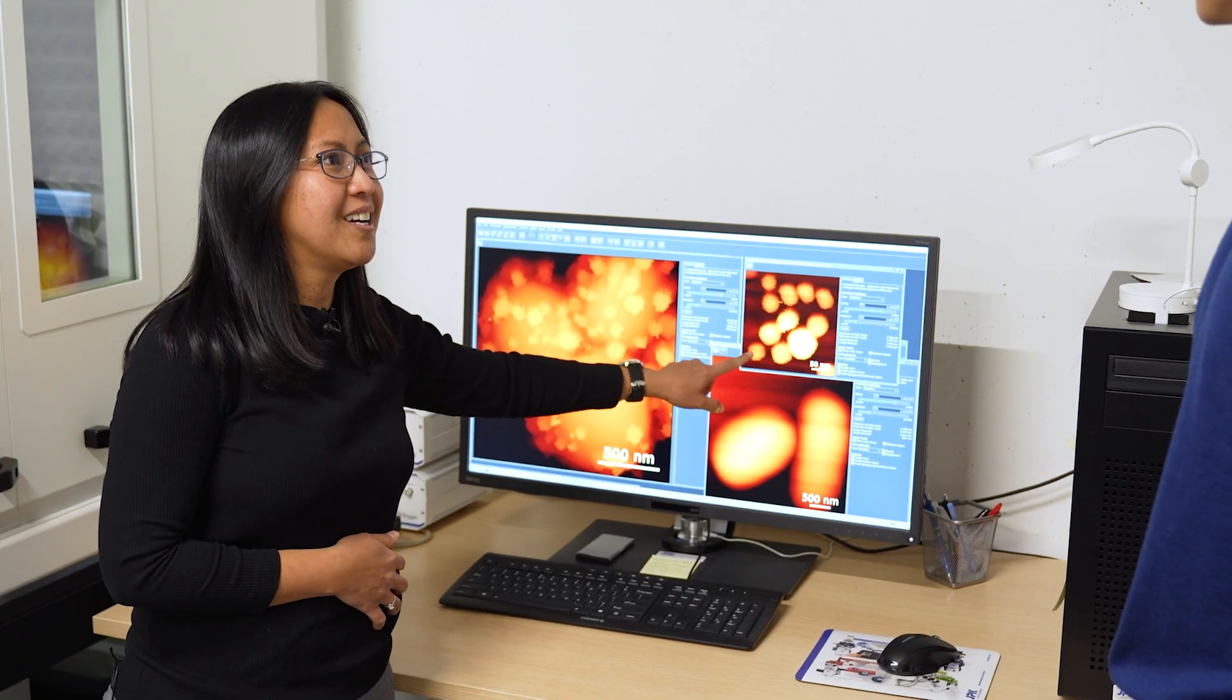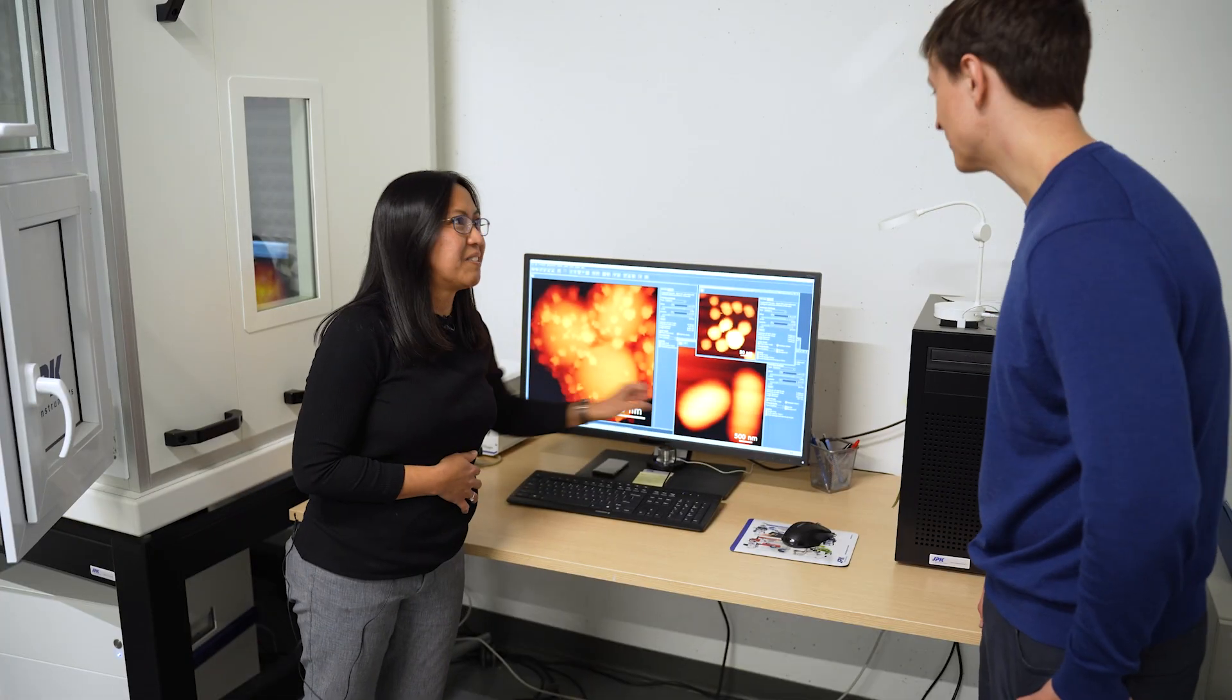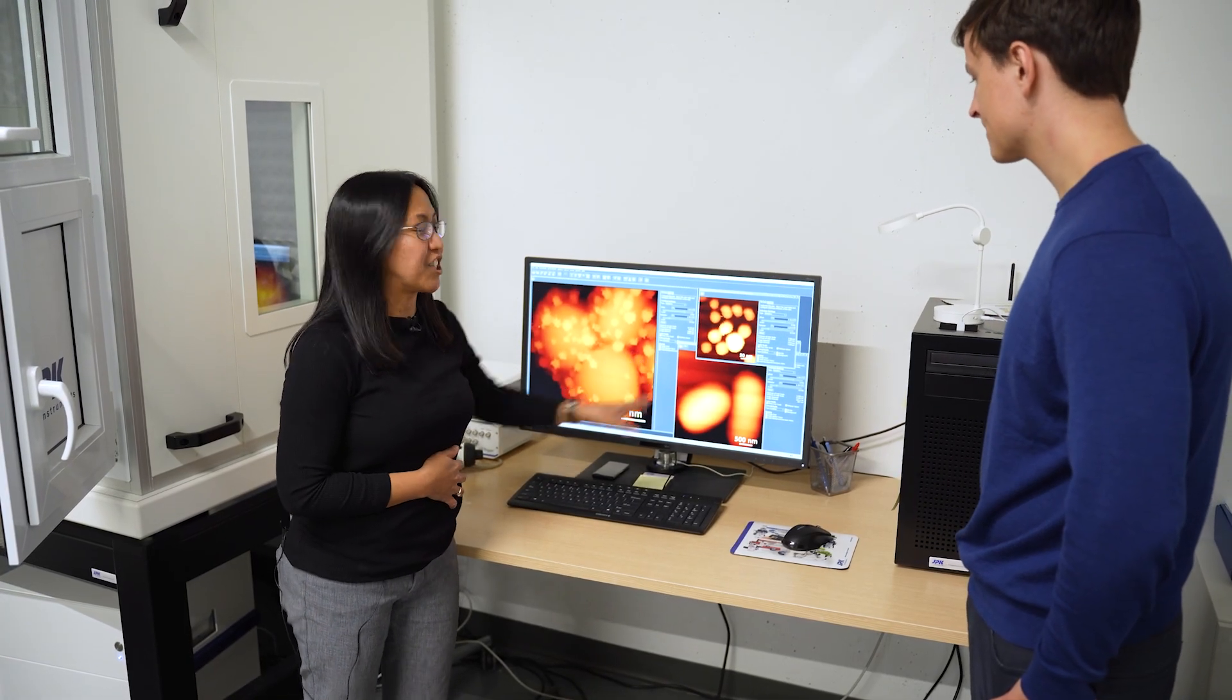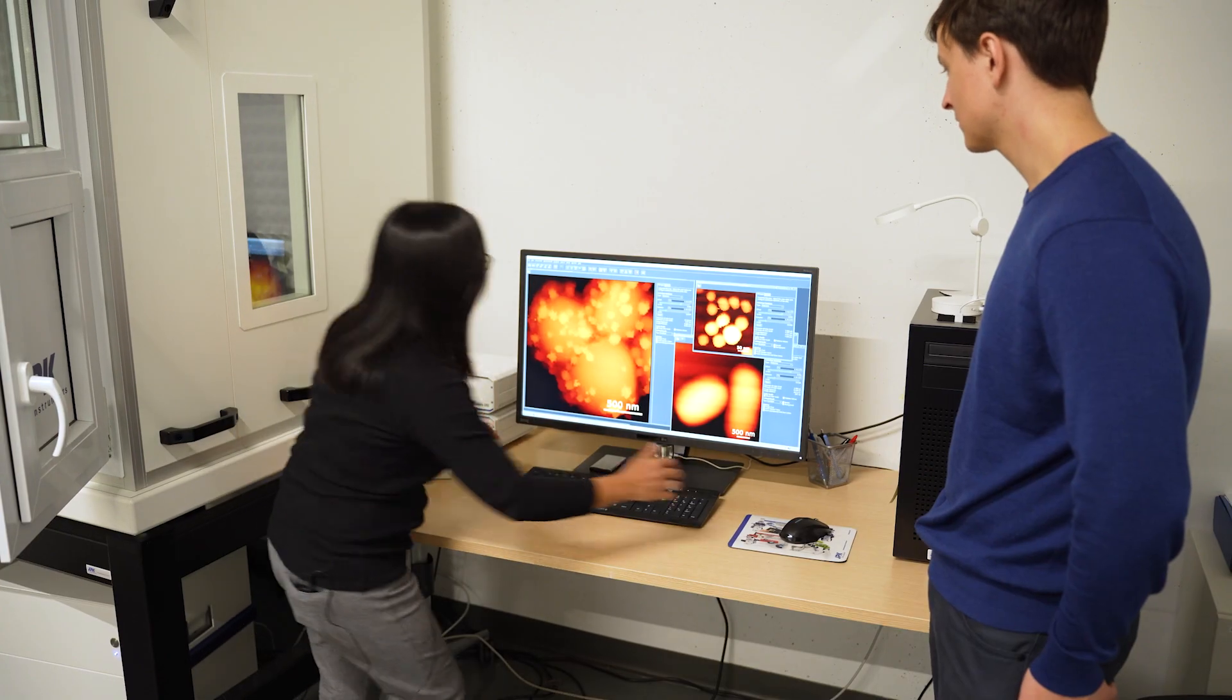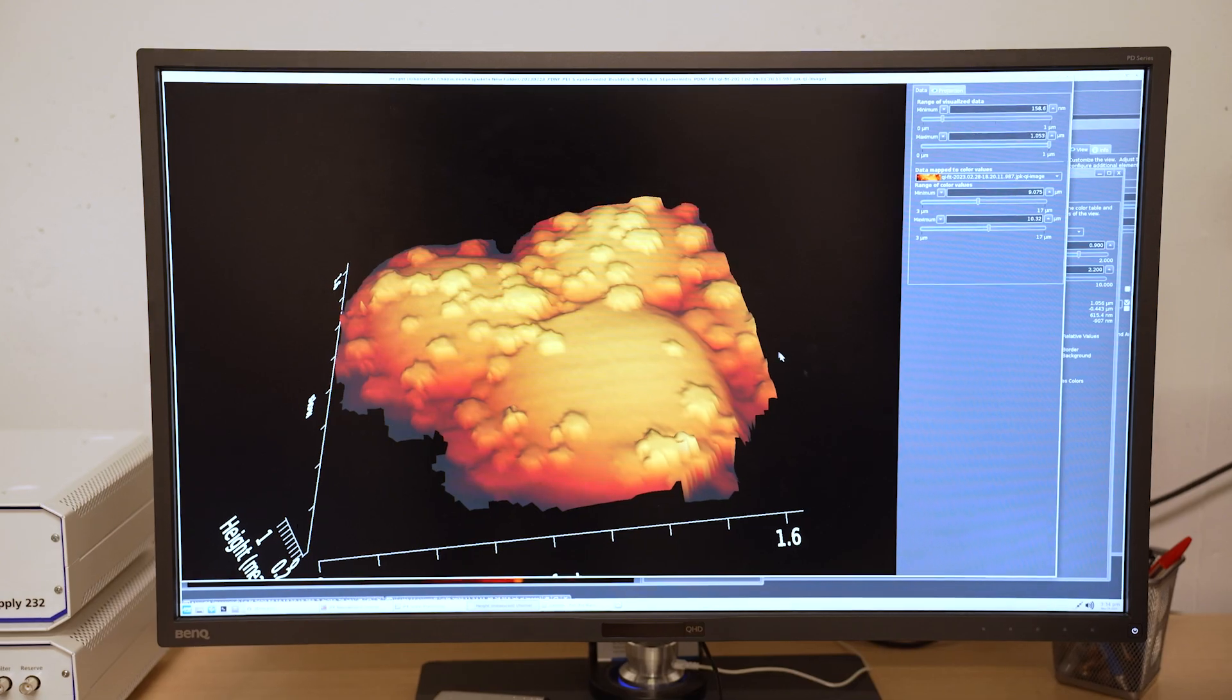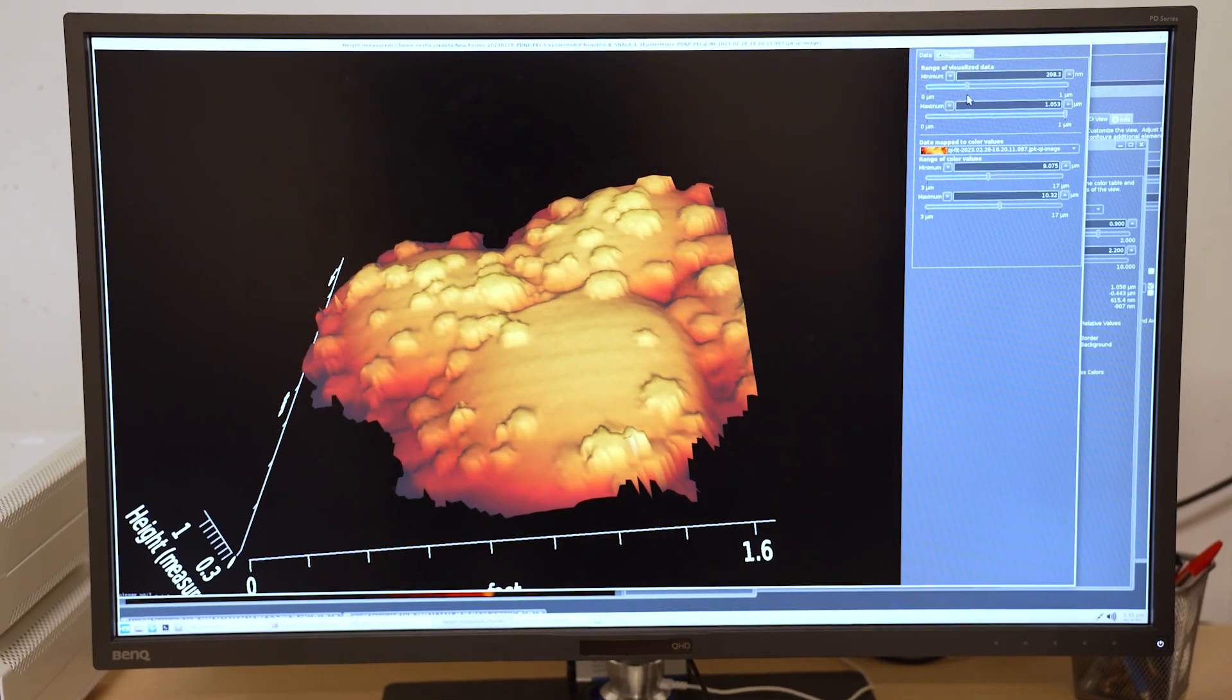See these guys here? They are your nanoplastics. I'd like you to look at the scale bar. That's really small. It is really small. And here are your bacteria. Okay. No nanoplastics that are overwhelming them, but see what happens when nanoplastics are interacting with your bacteria. They are literally littering the surface. You can actually look at the 3D projection of your image. And you have a better picture of how things are interacting.